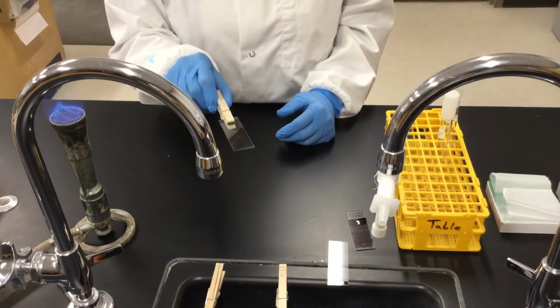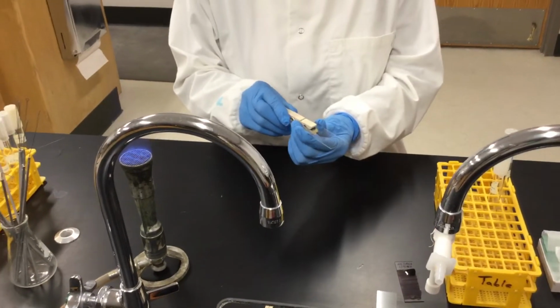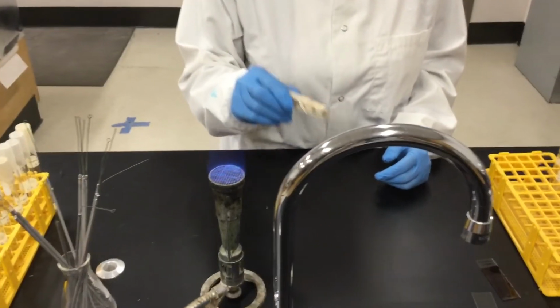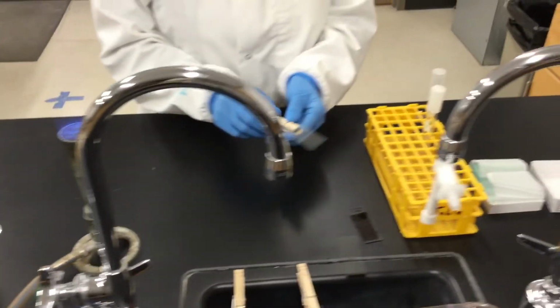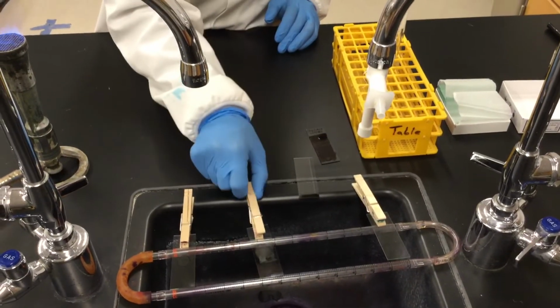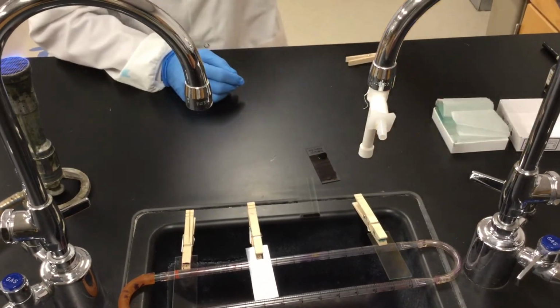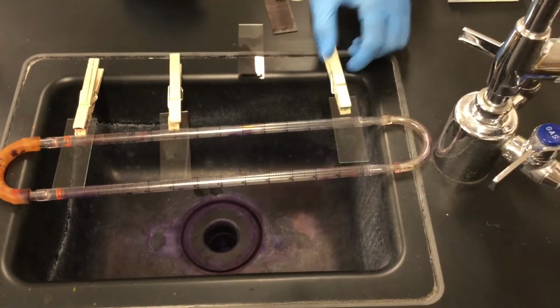Now this one is dry. So what I'm going to do, this is for the simple stain. And I know because I didn't put this circle or these lines in the bottom. So for this one, I'm going to heat fix 3 times, pass it in there. And in this, you will use just methylene blue for 1 minute, and then you rinse with water. So this is the first one that I'm going to do.